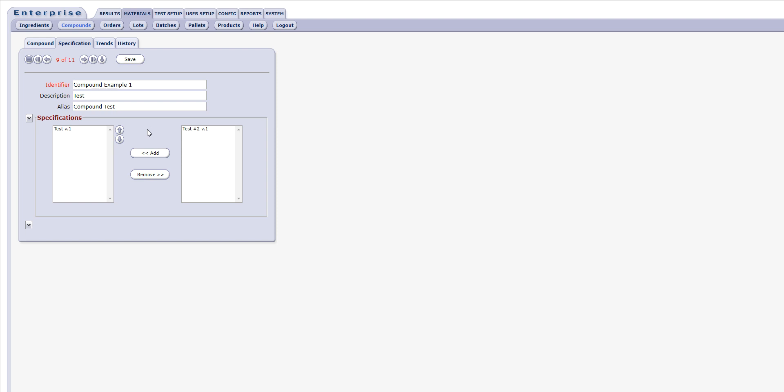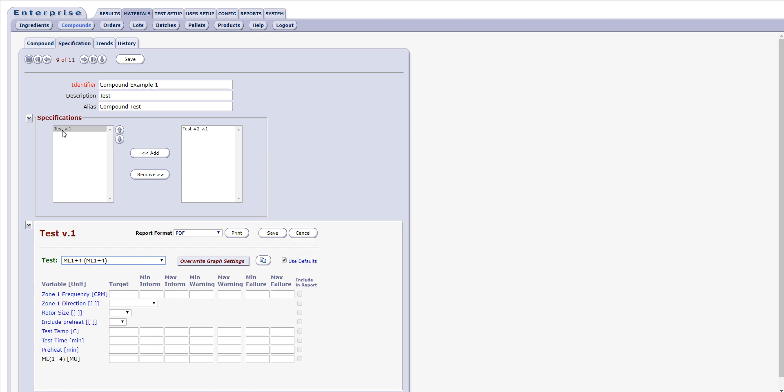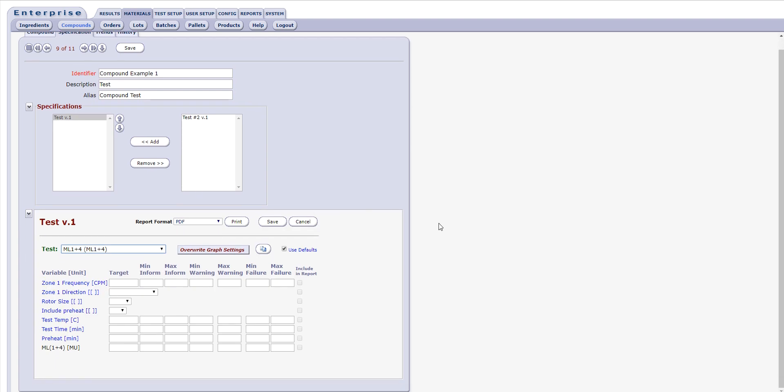Once a specification has been added, it can be selected by clicking its name in the left side box. Doing so will display the Specification Editor for the selected spec in the bottom of the form.